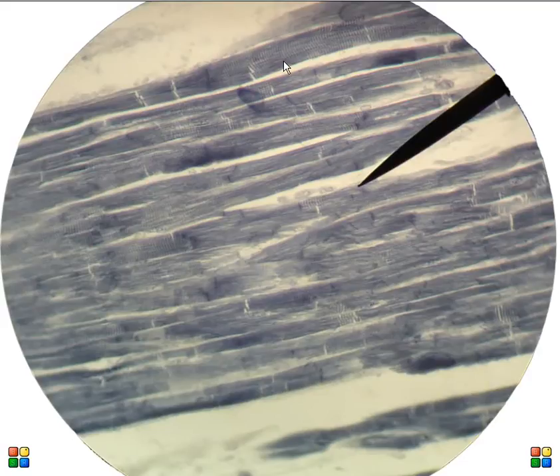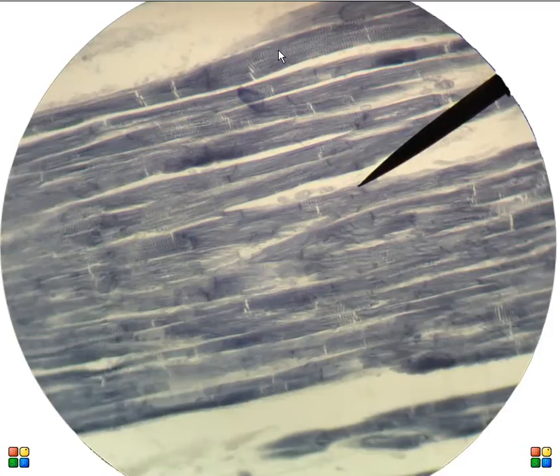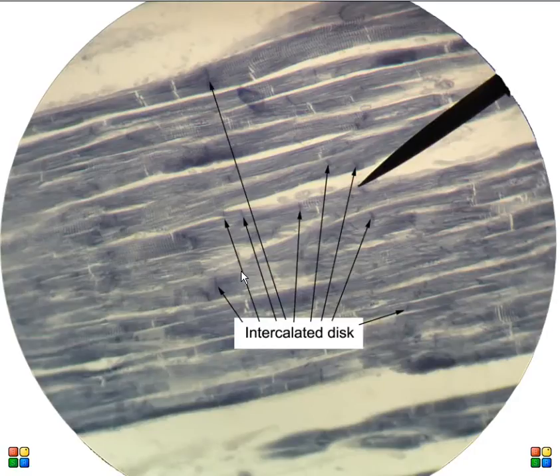You can also see the striations in cardiac muscle. The striations are created by those sarcomeres that we talked about on the molecular level when we talked about skeletal muscle especially. Another intercalated disc here — let me click over to the picture that's labeled.